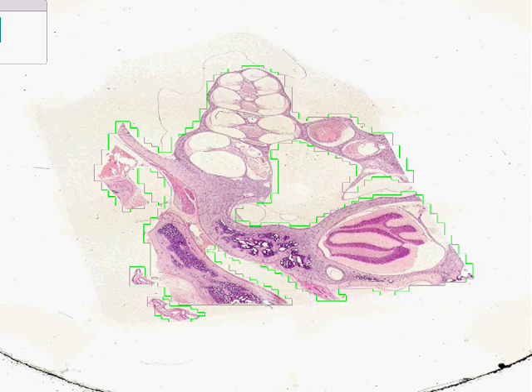This is a very nice section through the inner ear. In addition, because the inner ear is very close to the brain, you could probably quickly recognize this tissue as being cerebellum, but let's ignore that for now.